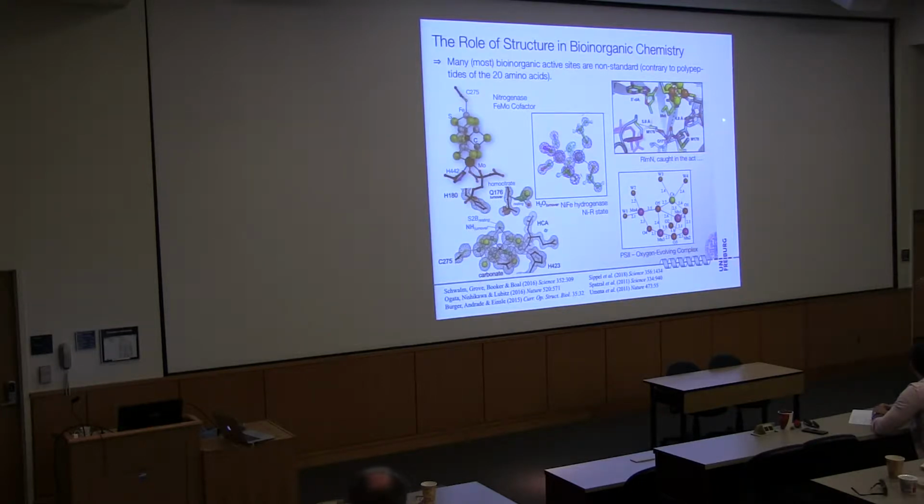If that is an enzyme like RlmN from Amy's group here, where you really see that it's not only about a metal cluster, and you also heard that yesterday, but it's the whole three-dimensional arrangement of an active site that you need to understand in order to get anywhere with interpreting how this catalysis comes to pass. This is a structure of nickel-iron hydrogenase from Wolfgang Lubitz's group, where they actually visualized a bridging hydride at a resolution of 0.9 angstroms. And of course, this is the oxygen-evolving complex, nitrogenase, or other large structures that we have.